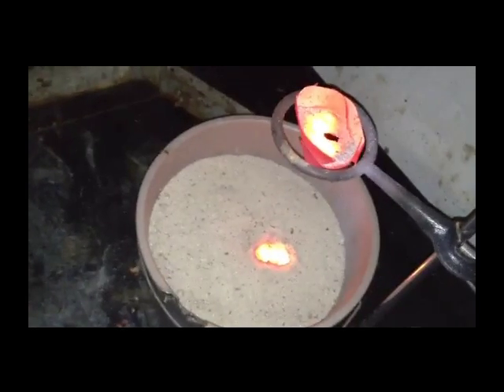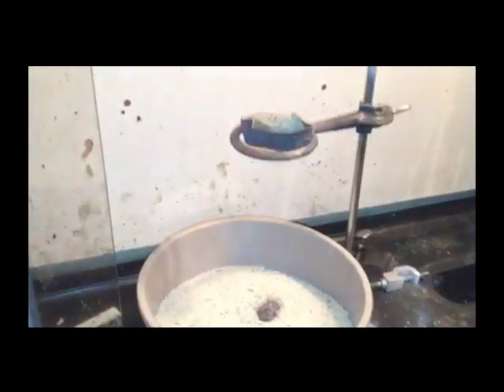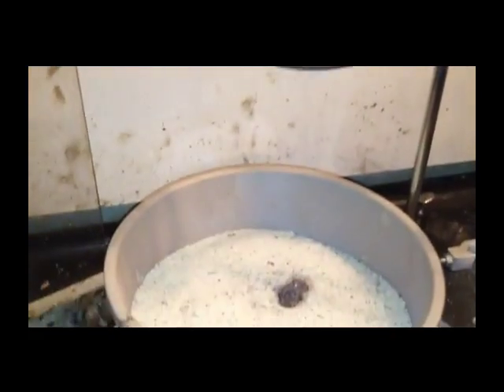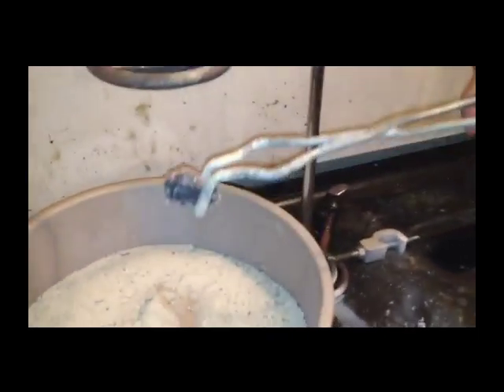Here you can see the hole that the molten iron caused in the copper bowl. This is the result of the reaction. Here is the unreacted thermite and some of the molten iron. And the majority of the molten iron and aluminum oxide is down there.